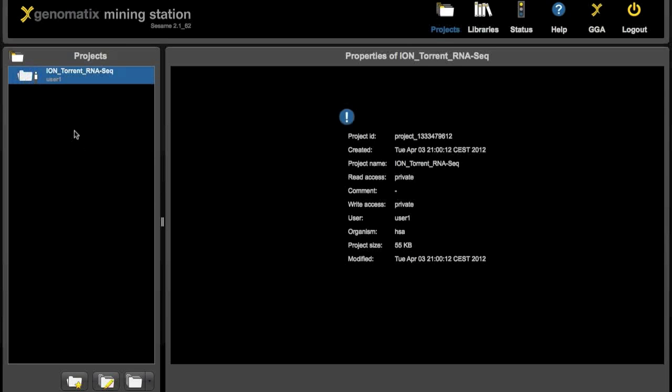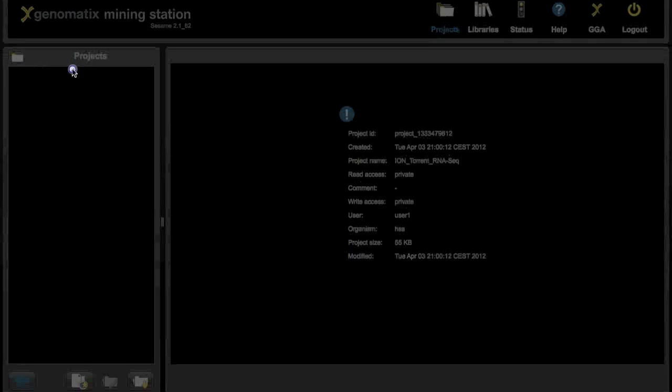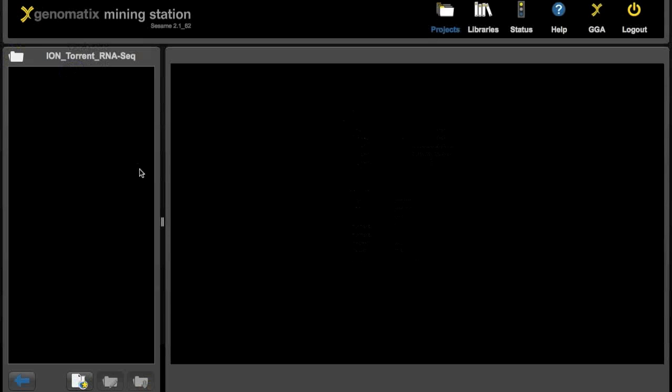Clicking on the icon will give us data like the creation date and size of the project. And to open it click on the name of the project. As you can see it is again empty. No data or results in it. So to add data or start an analysis click the new analysis button down here.